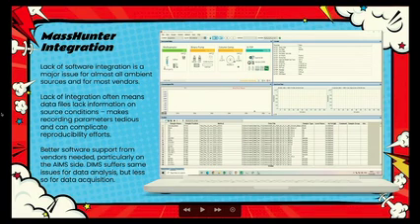They're not stored in the data file, so if you forget 6 months later, it's like, did I have that set to 250 degrees or is it 300 degrees? If you haven't written it down and saved it somewhere, it's not saved in a data file anywhere, you won't know. So it can be very, very difficult to record the parameters and to control the instrument in the software.